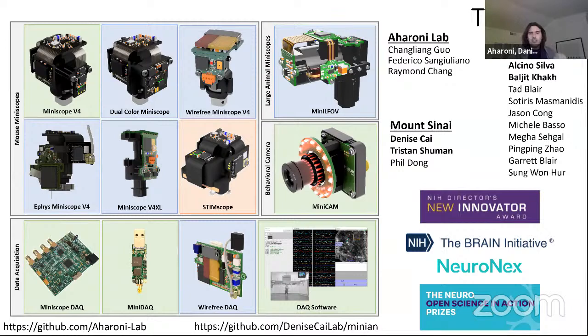In terms of commercial companies, there's a few. The main one people probably know about is Inscopix, which was started by Mark Schnitzer's lab and some of the people who initially developed miniature microscopes from the 2011 Nature Methods paper. There's Doric Lenses, which also makes a miniature microscope. There's Neurescence, which makes a fiber bundle-based miniature microscope. We generally have really good relationships with Doric and Neurescence. They're both very open with us and we're open with them, and we help each other out. That's not necessarily the case with Inscopix, but I think there's absolutely a place for commercial access to these tools, and open source tool development doesn't fully fill the need that commercial development can provide labs.